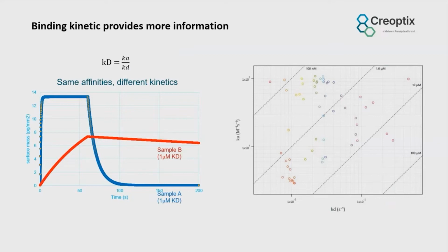One of the desirable characteristics usually is a very high affinity. This is how strongly they bind to their target, so that a drug can be administered at low dose and has an effect over several hours. However, the affinity is a function of the association over the dissociation rate. So we have here our association, and then here we have our dissociation.